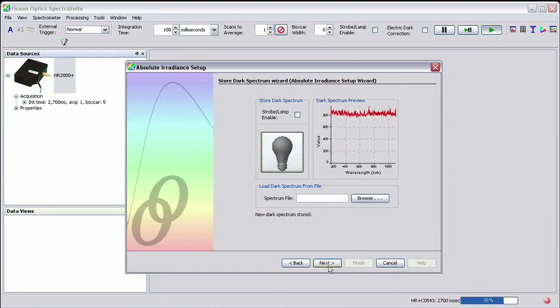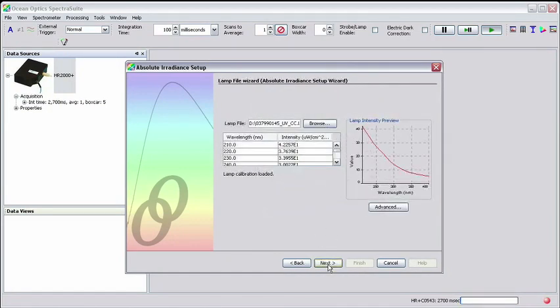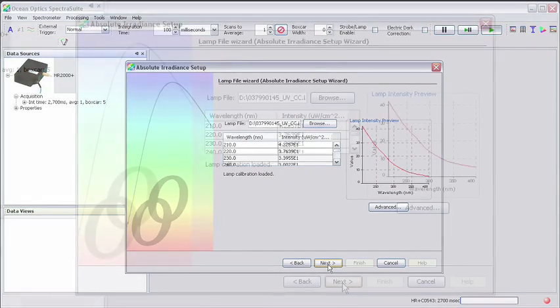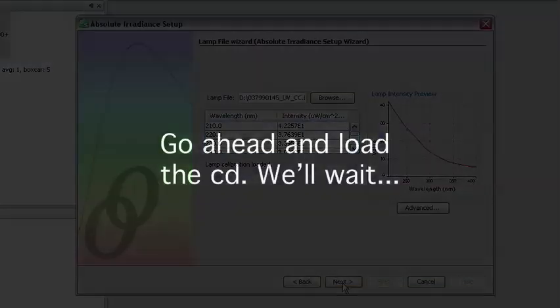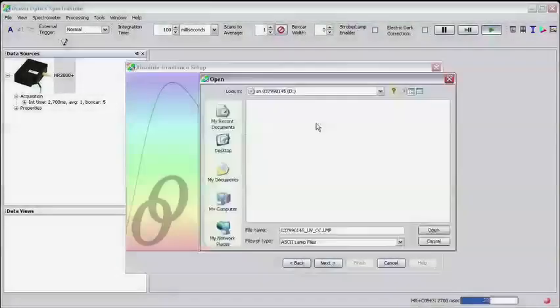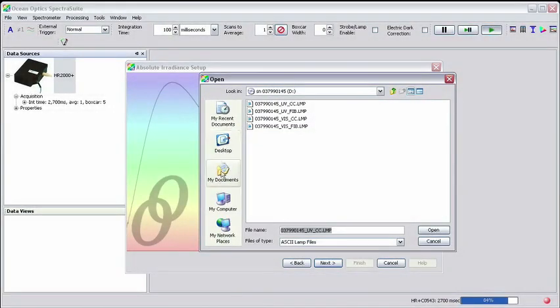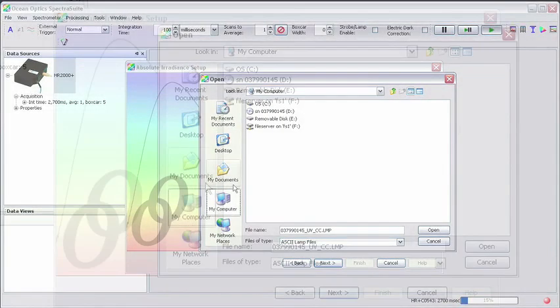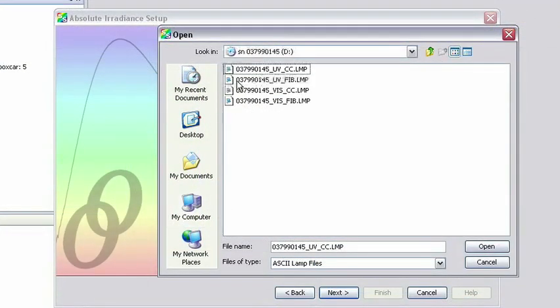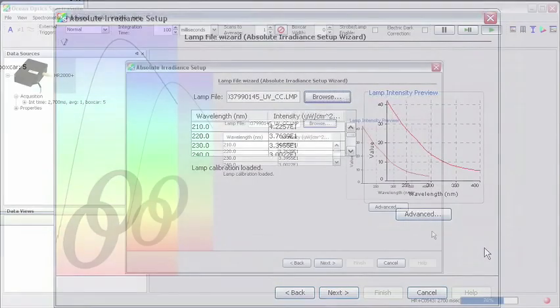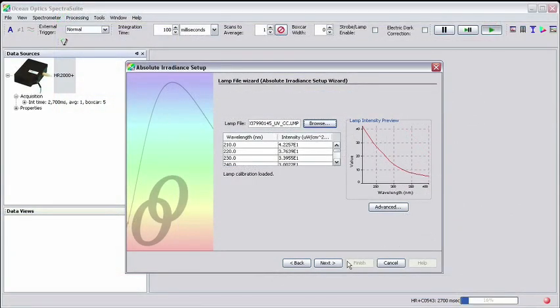In the next screen, you'll be asked to load the lamp file from the CD included with your light source. Insert the CD and browse its contents. Select the LMP file that contains UV-CC in the file name and click Open. Now click Next.